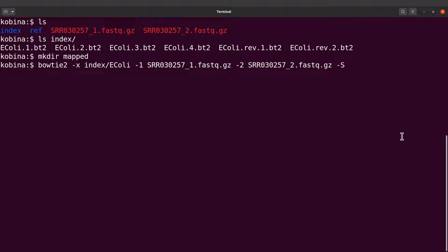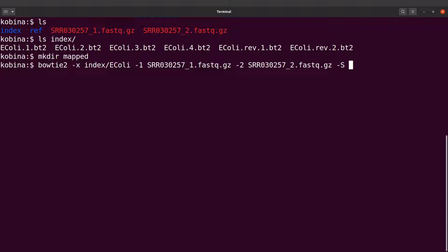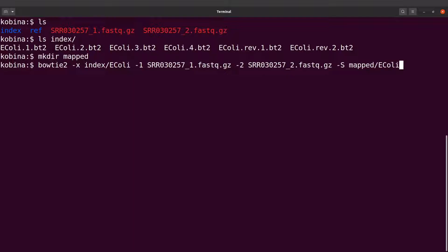to specify the output file. The -S flag is used to specify the name of the output file. Bowtie 2 will generate a SAM file, so we need to specify the name. We say -S mapped/Ecoli.sam, and then we will run it.